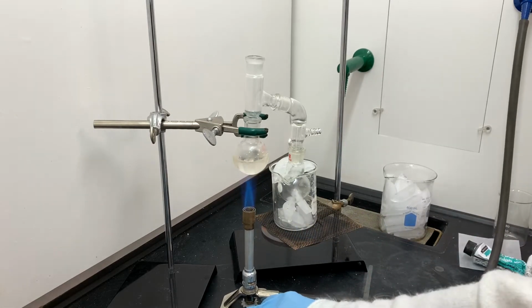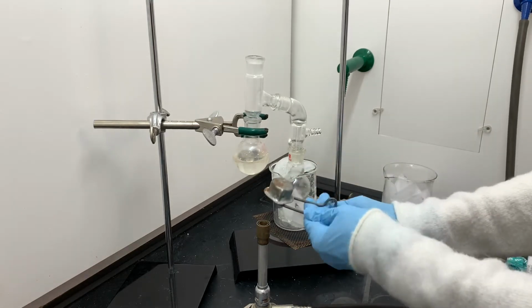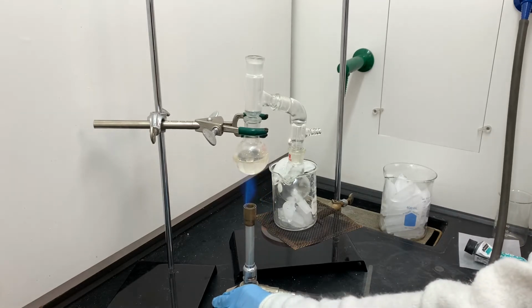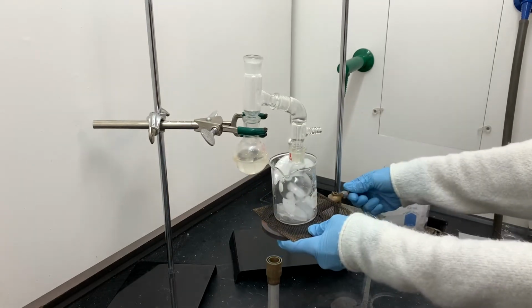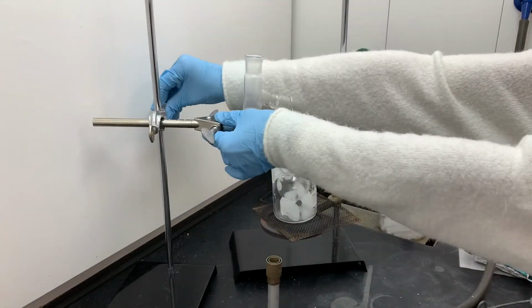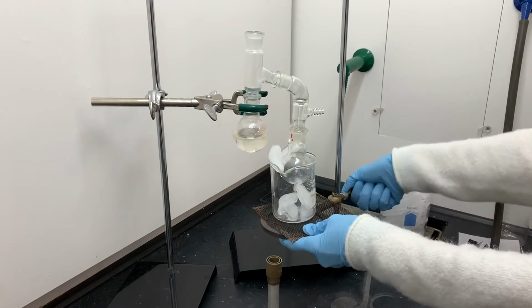Positioning this Bunsen burner underneath the round bottom flask, the goal here is that I want to use gentle heat. I don't want to use this like a blowtorch. So I want to make sure that the blue tip of the flame is not too close to the round bottom flask because I don't want to heat it up too much. The way that I have it positioned right now, you see that the blue tip is right at the bottom of the round bottom flask. That's way too close. The solution is going to get way too hot. What I don't want is to accidentally boil any of the sulfuric acid or the pinacol. Remember, we only want our product to be boiling out of solution.